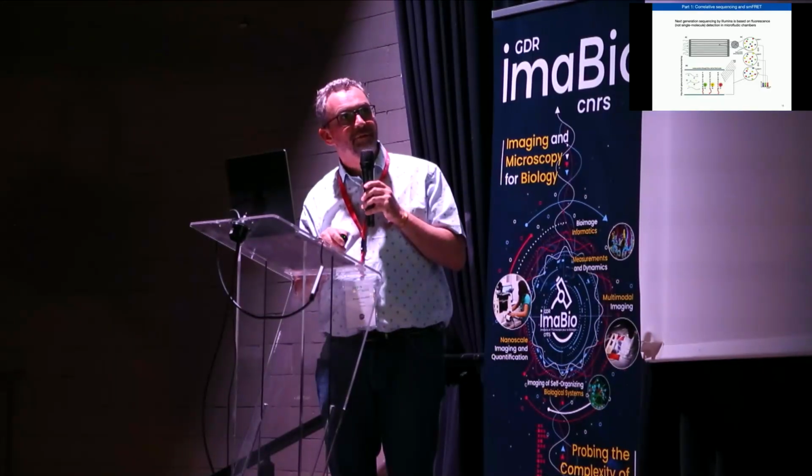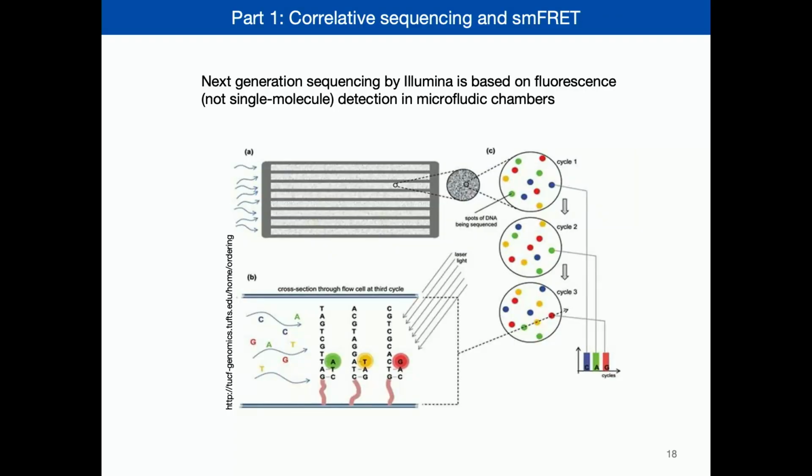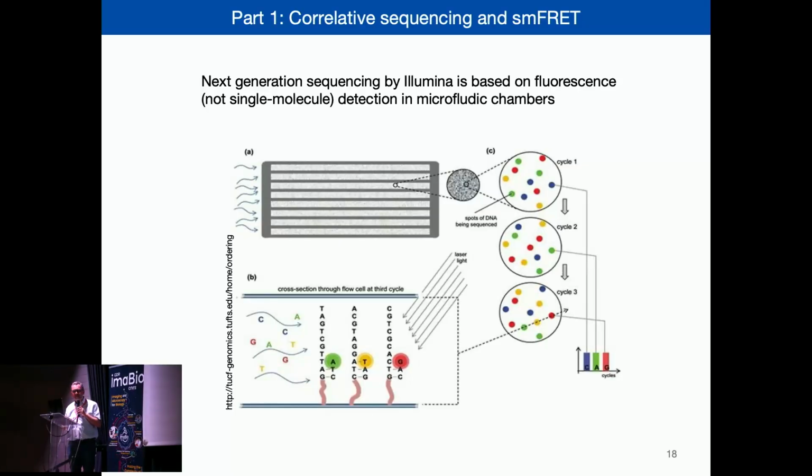So you have a surface where you can immobilize the DNA that you would like to sequence. You amplify it, and then you have your 4 nucleotides swimming through the solution with fluorophores attached, and then you just read out which color was attached, and by that you reconstruct the sequence of your original DNA strand. Though I would like to point out, this chip and this methodology is not single molecule based. It typically has hundreds to thousands of strands that carry, hopefully, all the same kind of fluorophore, and this is a signal that you can then easily read out.